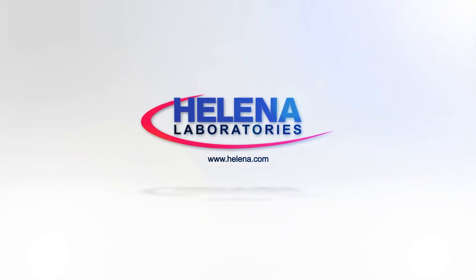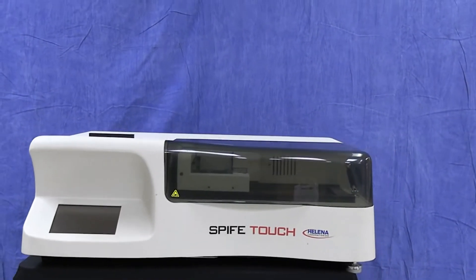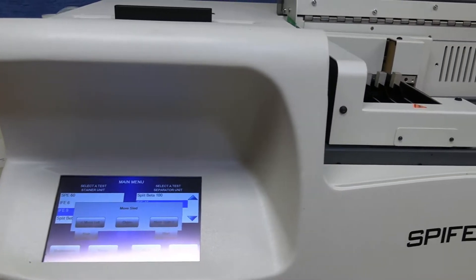The Spiffy Touch continues the excellence of its predecessor, the Spiffy 3000, providing semi-automated gel electrophoresis for up to 100 samples per gel.